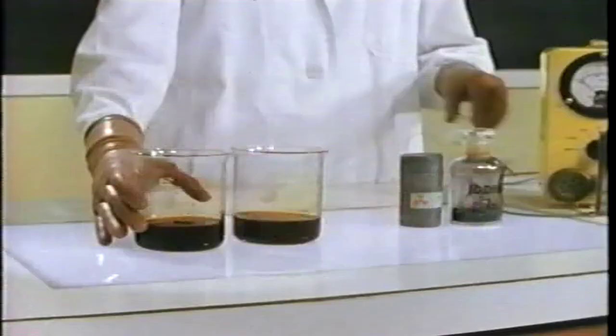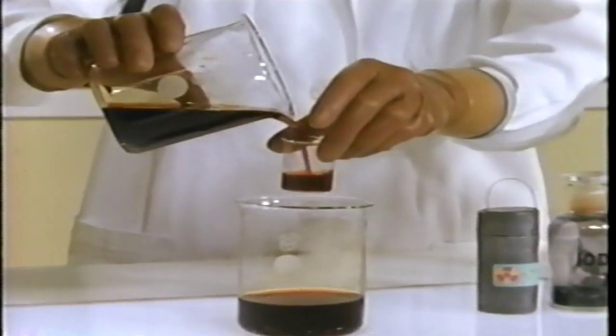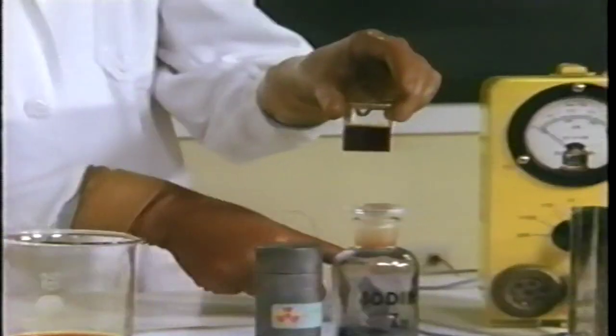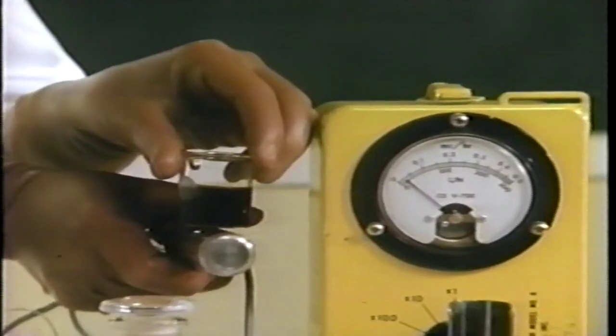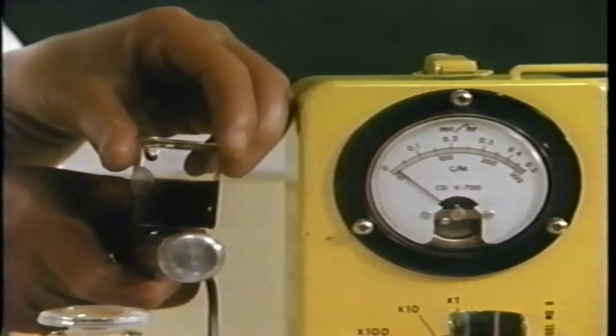To find out, we pour off some of the solution, leaving all of the solid behind. Now we can test for radioactivity in the solution. The small deflection on the meter shows a low level of radioactivity. Some of the radioactive solid has dissolved.